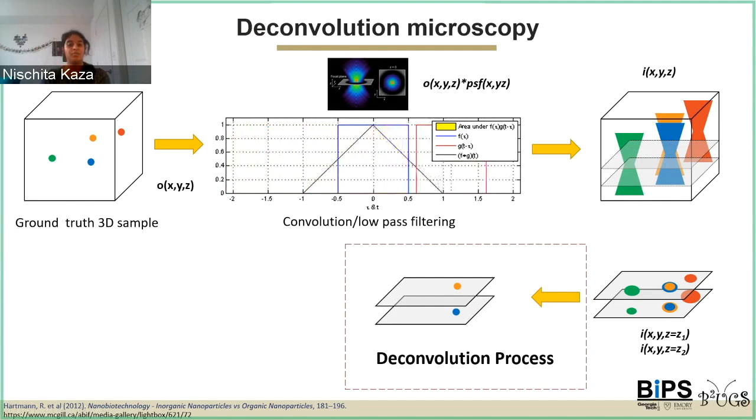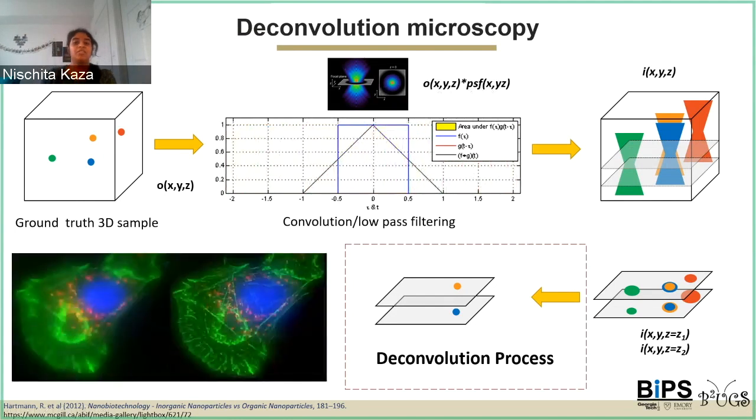Now, there are many different ways to do this, and a lot of the methods are pretty involved. But the simplest method could be just some type of filter. What this results in is a big improvement in image quality, because you can now eliminate all the out-of-focus light and get a clear, crisp image that's in focus. So this is just a very superficial overview.